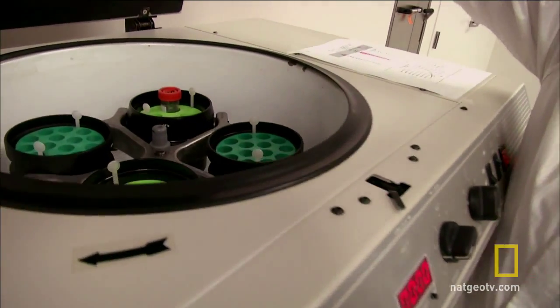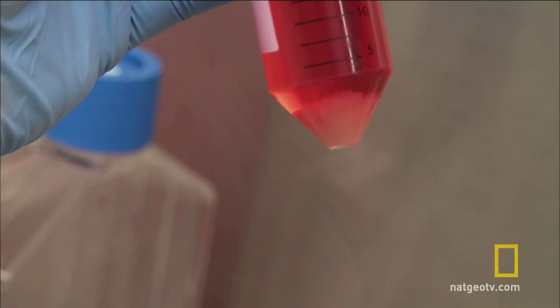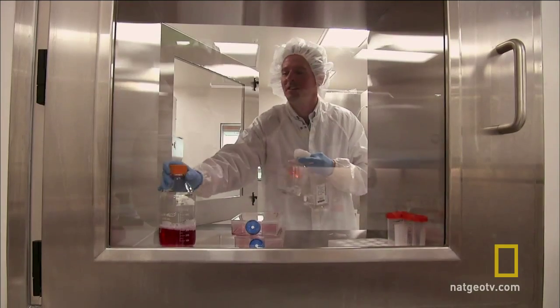For this test we're going to print a mini liver. It will be just half a millimeter deep and four millimeters across but can perform most functions of the real thing.